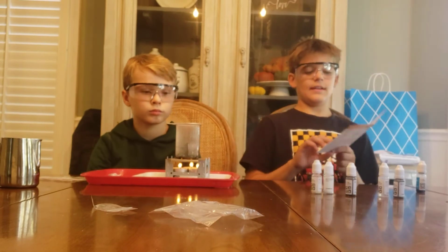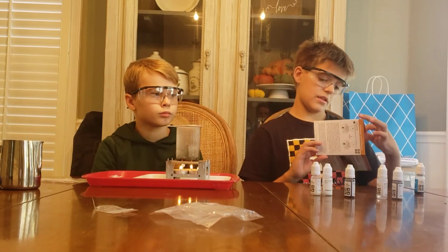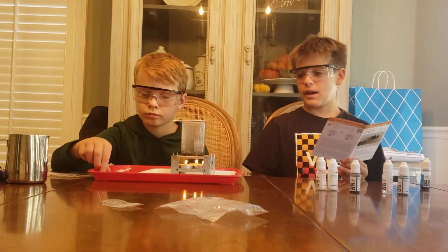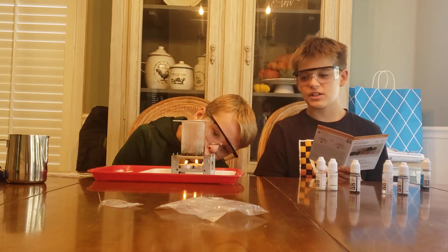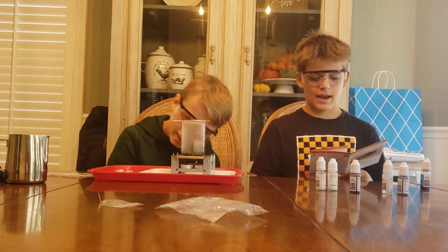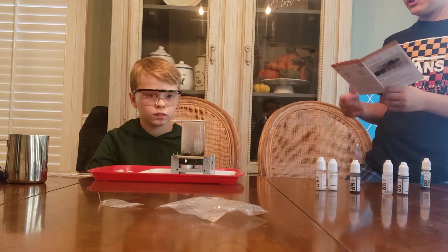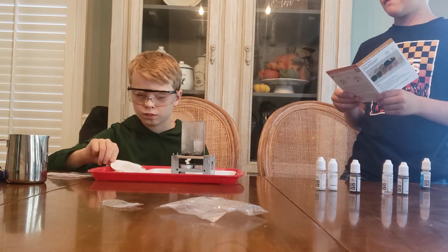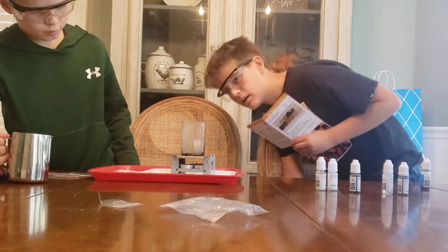Okay, so now we're on step 6. This is the second to last step. We have to extinguish the candles on the bottom. So, Jesse, blow them out. Okay. After you extinguish them, we're going to take off the filter paper. Be careful. And pour in the water until the 50 milliliter line.